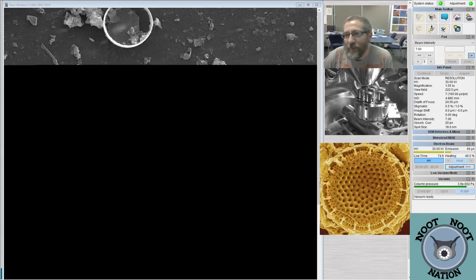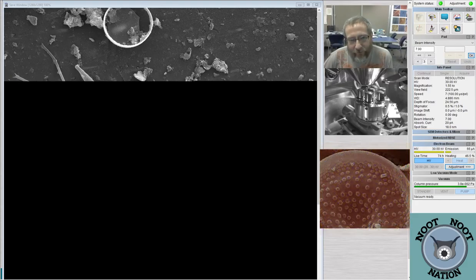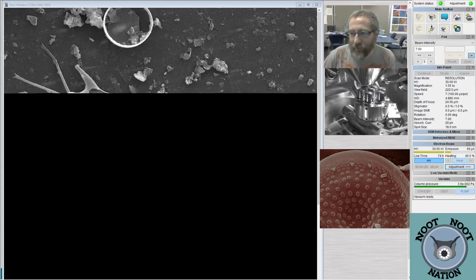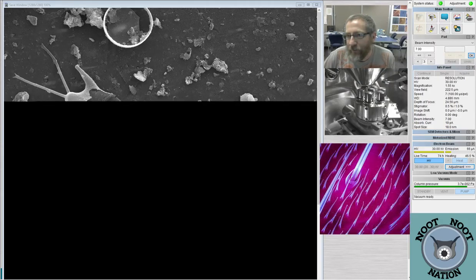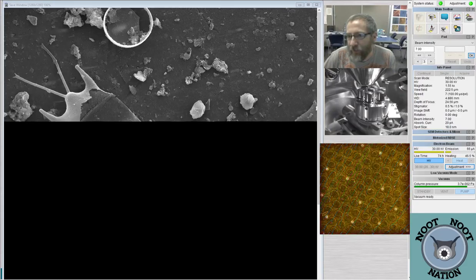Let's see. I did get some questions. MSG asked, what are we looking at right now? So we're looking at plankton samples on the scanning electron microscope from San Francisco Bay. These are mostly diatoms, although we have seen some other things in here. Blue says that it looks like a cigar ribbon. I guess maybe they mean the Pseudo-nitzschia colony for that one.